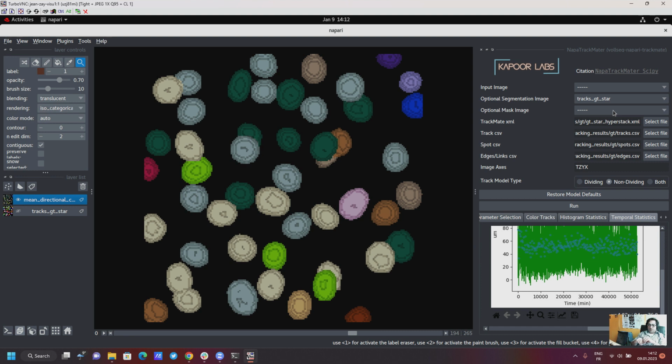But so far, this is what is available, and this is work which is not funded by CZI, but it is funded by my collaborators who I'm developing this plugin for in Copenhagen. So somebody is paying for the development of the plugin, and I'm happy to hear your suggestions to develop it even more, and add as many reads as possible, to make you just sit in front of the computer so you can easily analyze what's in my data, how do I do the track analysis, and these tabs would contain the different analysis that you can get from this TrackMate universe, let's say. So thank you for your attention and see you.